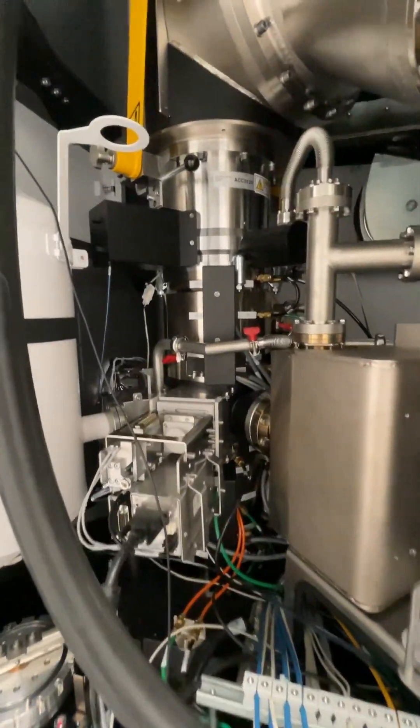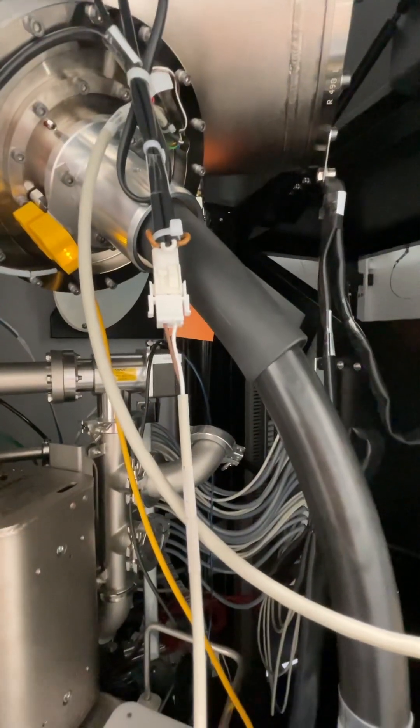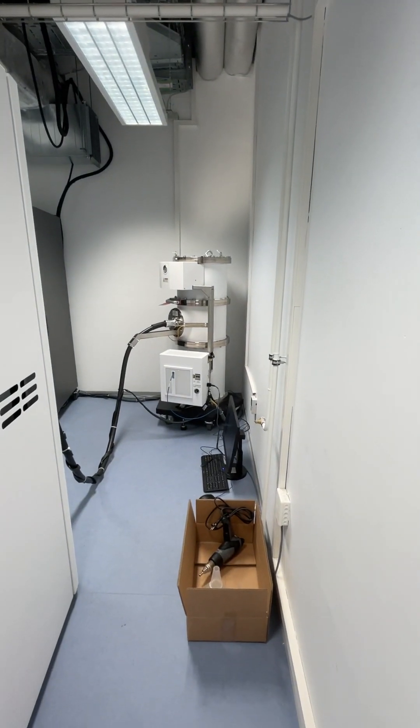There's the column itself, and you can see it turns here. This big wire is our HT cable — it goes out and around to the HT tank over there.